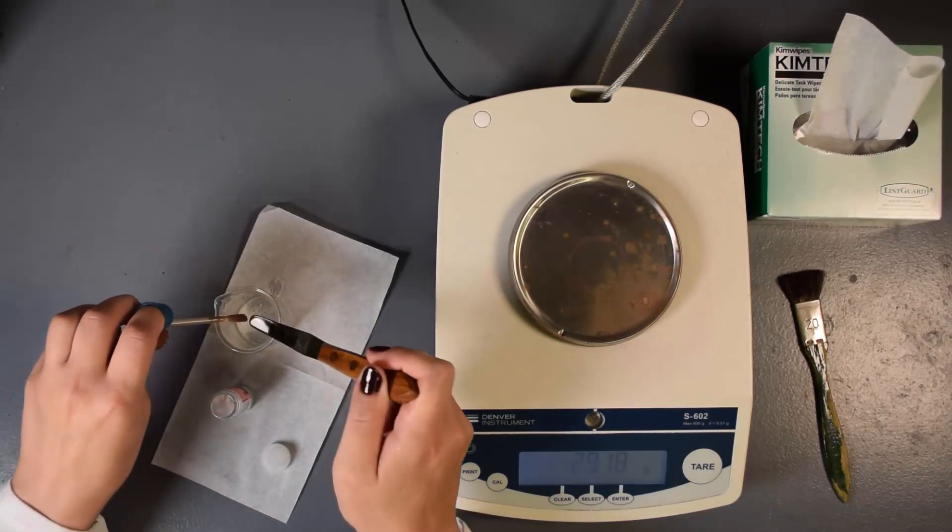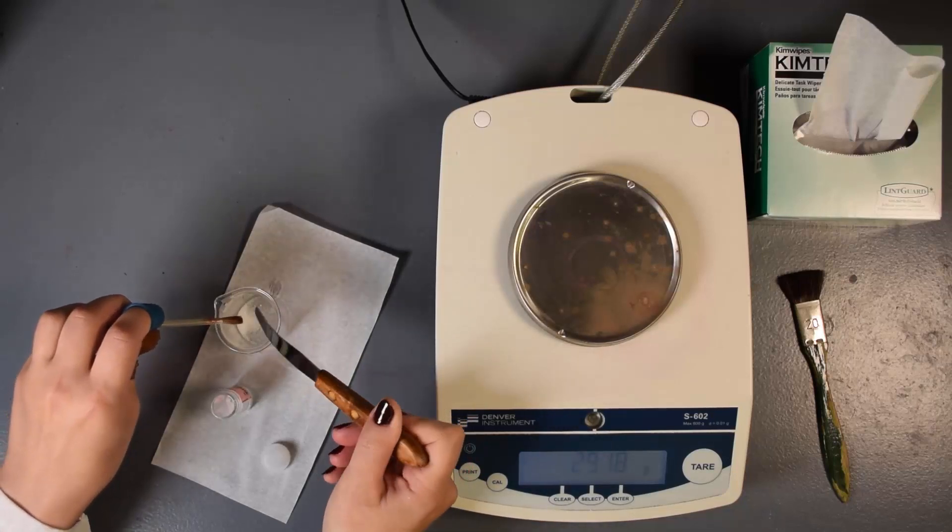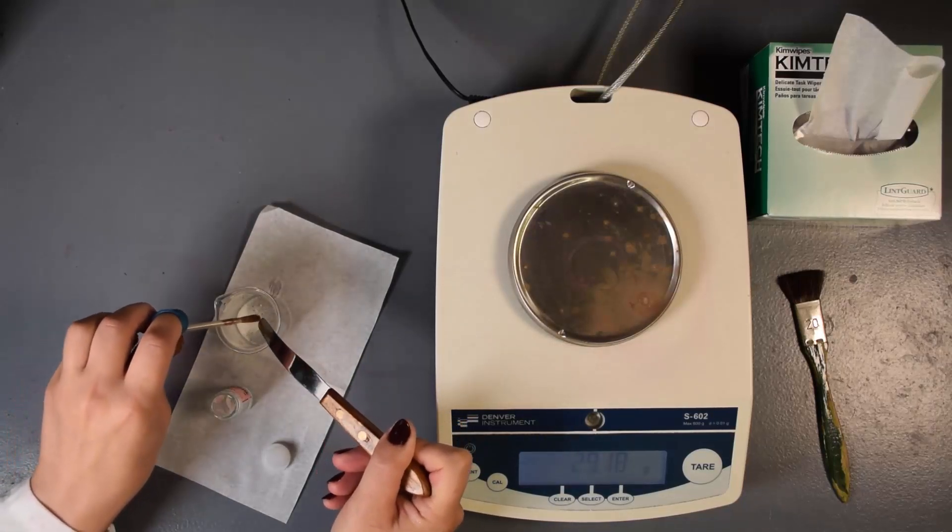Notice how both sides of the spatula are gently brushed into the beaker, followed by cleaning any compound from the camel hair brush into the beaker.